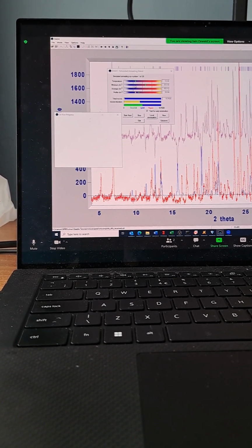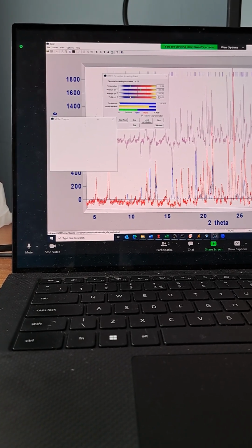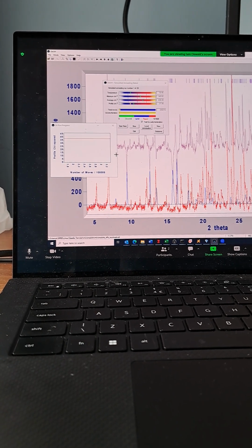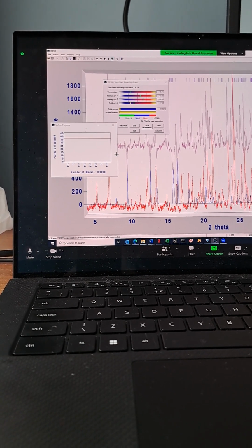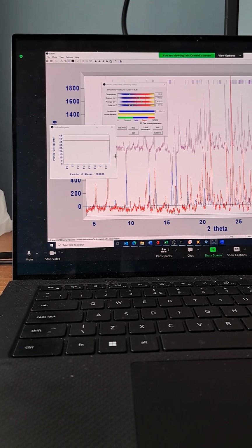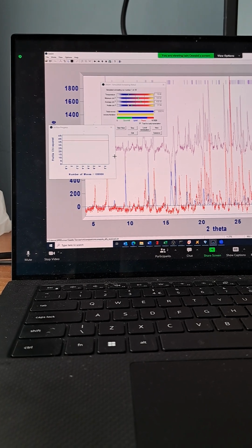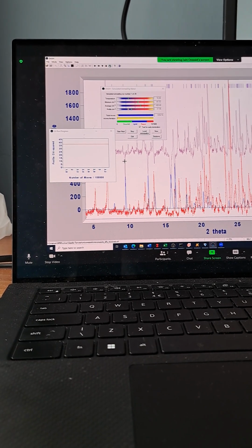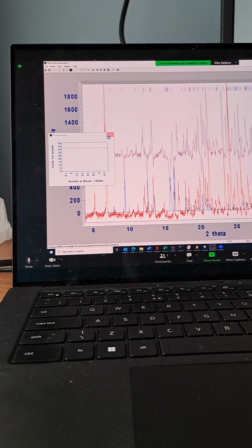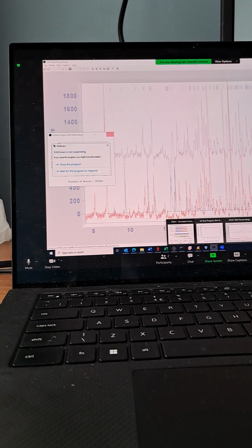But you can see it comes up with some sort of result. This is something you can put on overnight. So the last thing you do, whatever, 5 o'clock today, you can set this going and just let it run overnight. Keep it going. Don't close the lid of your laptop. Put it up high somewhere in a room where your dog can't get it. Just let it work over that period, and it means that the thing is doing its best and will do what it needs to do.